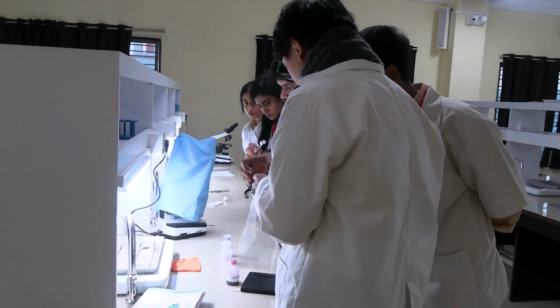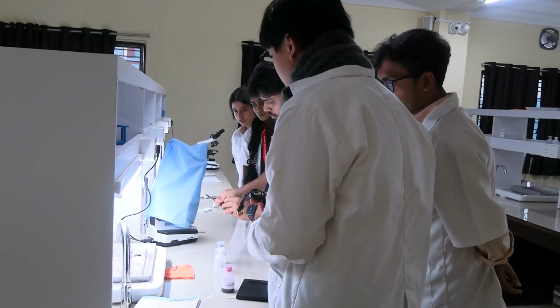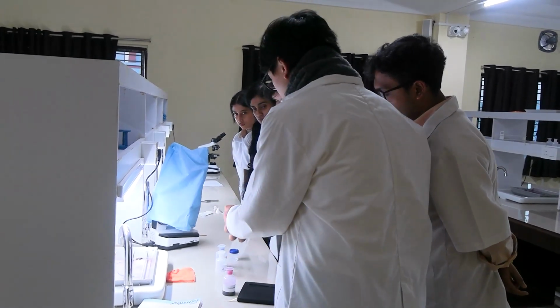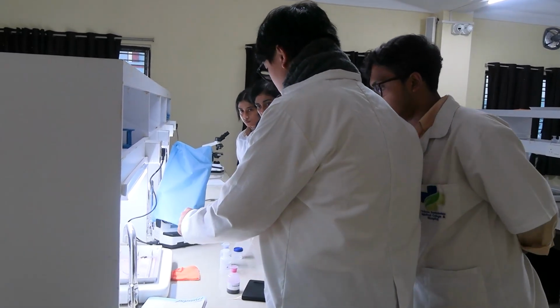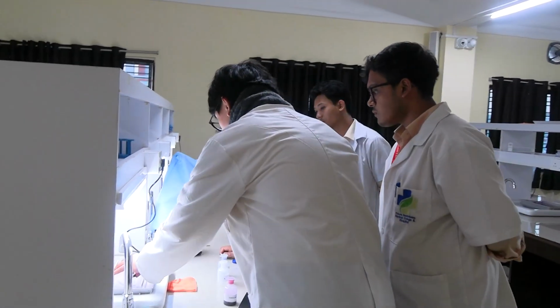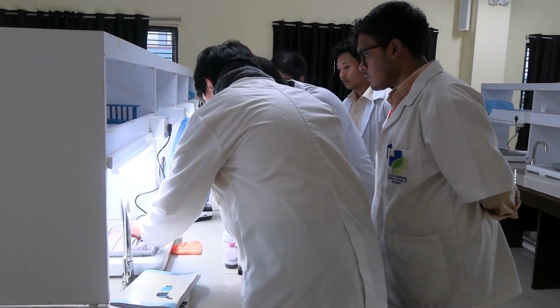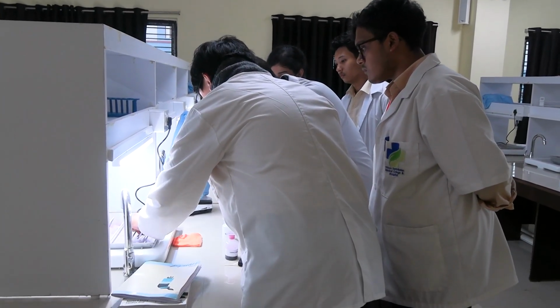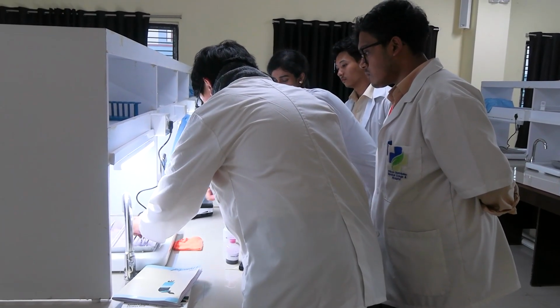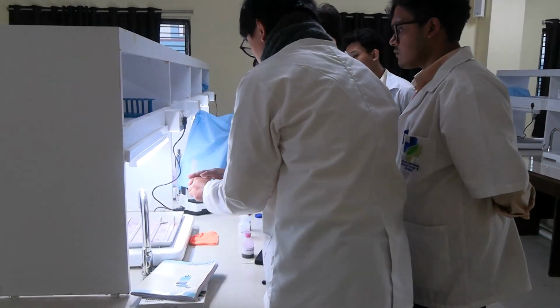Okay. So hold this in your hand like this. Wait. Okay. Now take this underneath and move it in a zigzag way. Okay, very good. And now don't touch the smear. Okay, we'll look for some bubbling. Okay, the bubbling has already come, so you just move it out of the way. Okay.